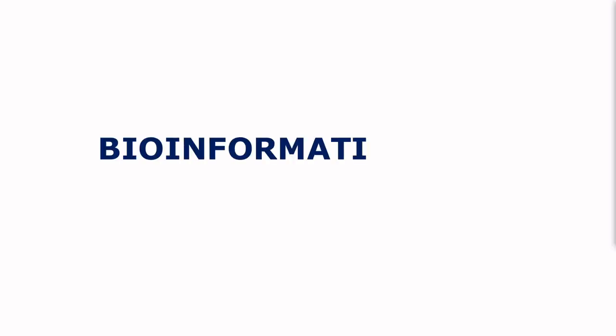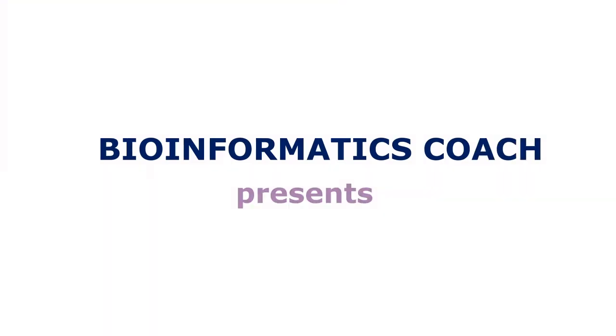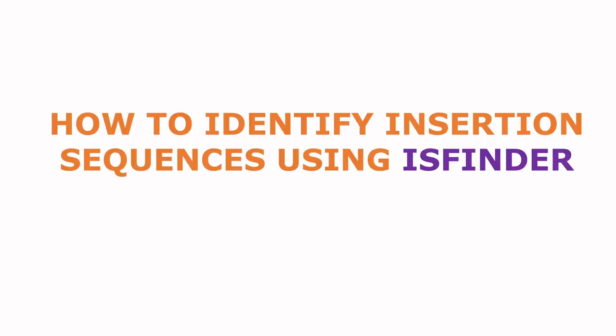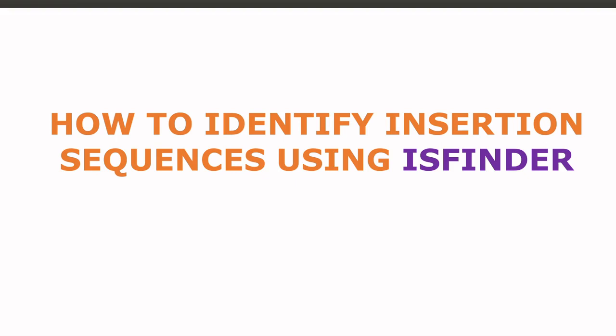Hello guys, welcome once again to another tutorial session on bioinformatics. In today's video, I'm going to show you how to identify insertion sequences using the ISFinder database. Now let's get started.